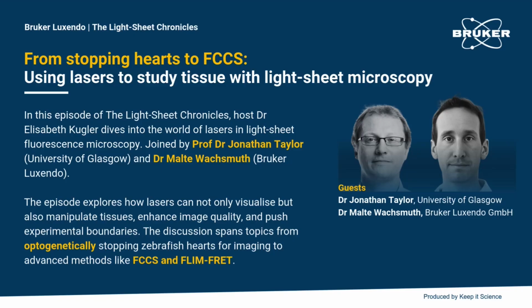I think, like I said, one really difficult thing is that the implementation is quite challenging, especially getting all the maths right and setting out the experiments in the correct fashion. But I assume, as with most techniques, applying it from confocal to light sheet is a very different challenge. So maybe you can talk with us about what makes it even more challenging to integrate a technique like FCS or FCCS with light sheet microscopy, Malte.